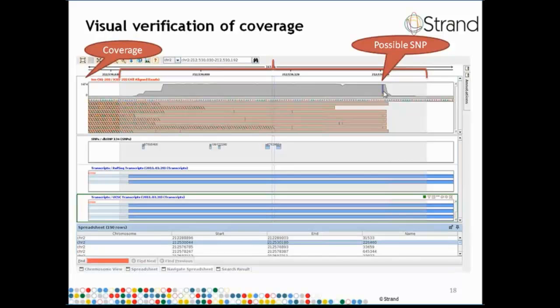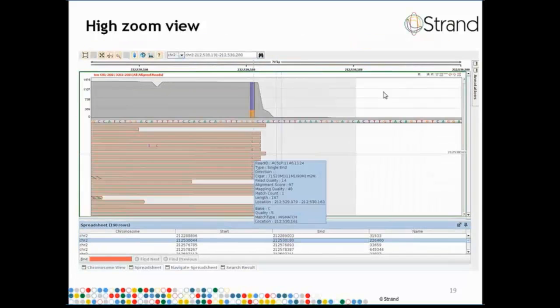The Genome browser supports a very good zoom functionality, so one could try to zoom into that particular location to see the bases in more detail. As we do that, you'll notice that these are all Cs out here, but some of them are brighter than the others. That's because the density of the base indicates the quality of the base. By hovering the mouse pointer on any of those bases, we get a tooltip which provides comprehensive information at the base level and at the read level. We can see that some of the bases have low quality. For instance, this base has a quality of 5.